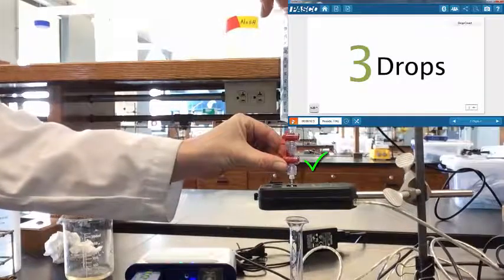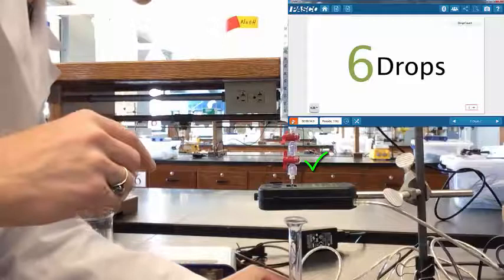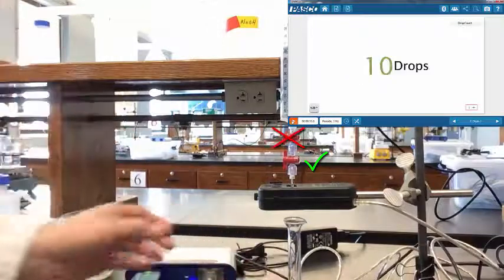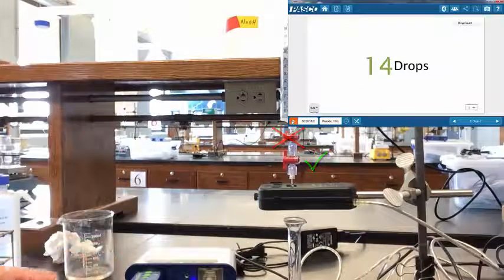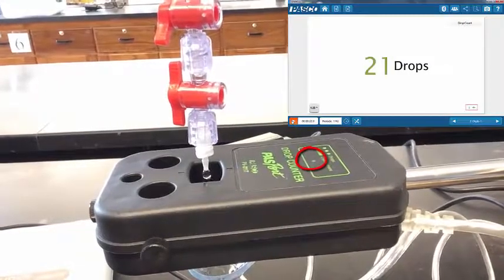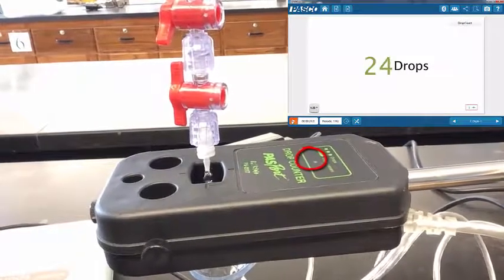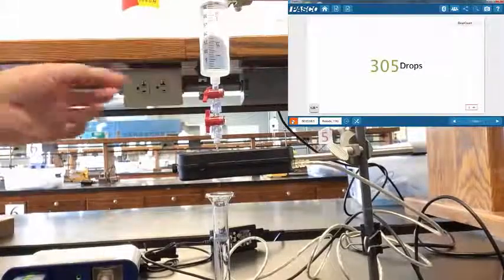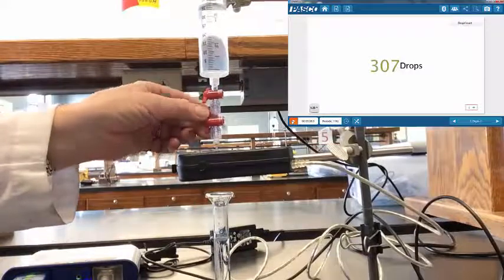When you are ready, open the bottom stop cock and make sure you do not adjust the top stop cock. If you look at the face of the drop counter, you will see that there is a green LED light that flashes every time a drop passes through the drop counter. It is important that you check that this LED is flashing which will tell you that the drop counter is functioning properly.